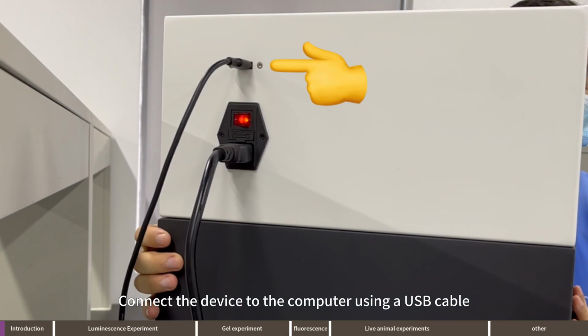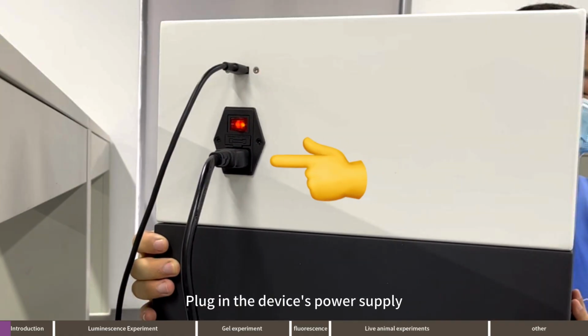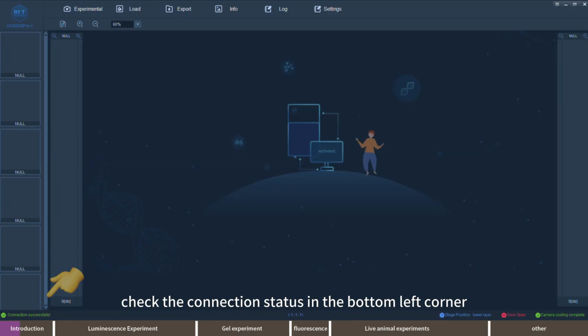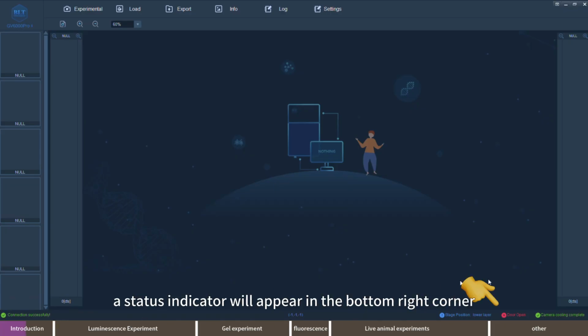Connect the device to the computer using a USB cable. Plug in the device's power supply and turn on the power switch. The smart breathing light will illuminate. Open the software and check the connection status in the bottom left corner. Once the connection is successful, a status indicator will appear in the bottom right corner.